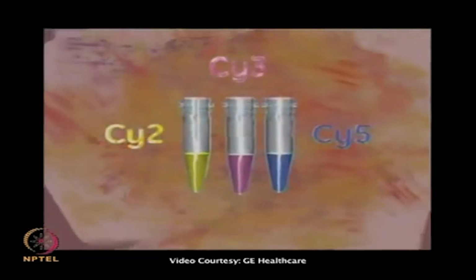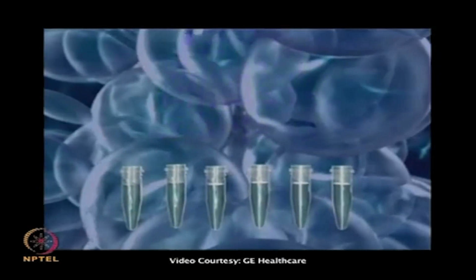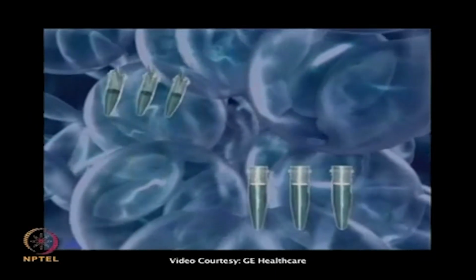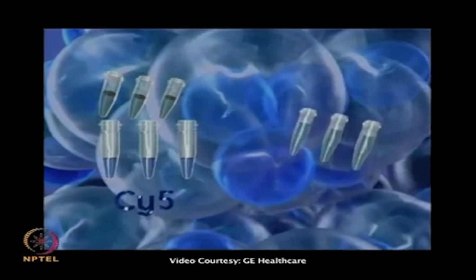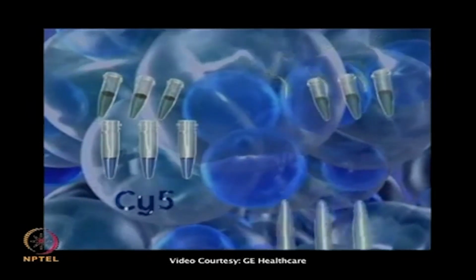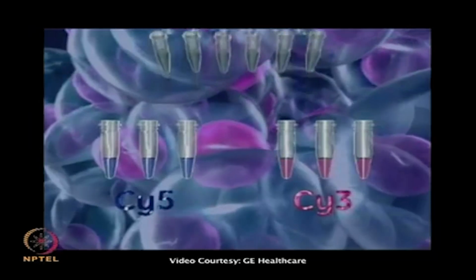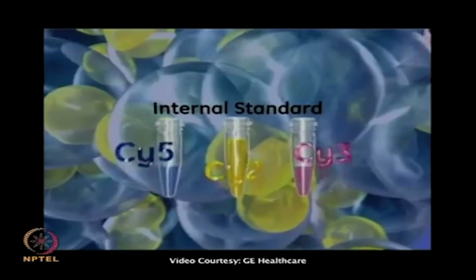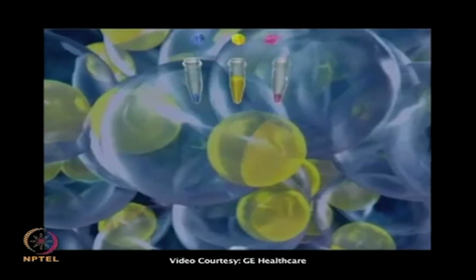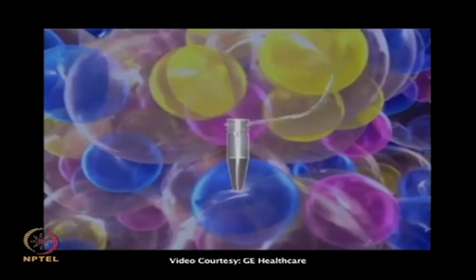Yes, as we were talking about, the three samples we can label with Cy2, Cy3, Cy5. Now you have two different samples from different sources. You take these samples into different Eppendorf tubes, and you label one with Cy3 dye and another with Cy5. Then you take the other two samples, pool them and label with Cy2. Then you mix those three into a single tube and run it on a single strip.